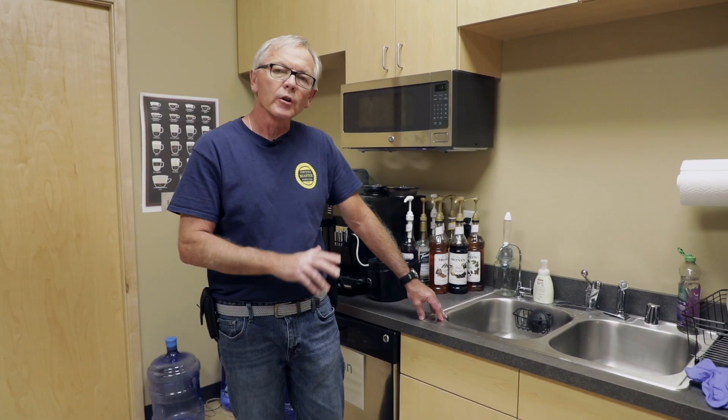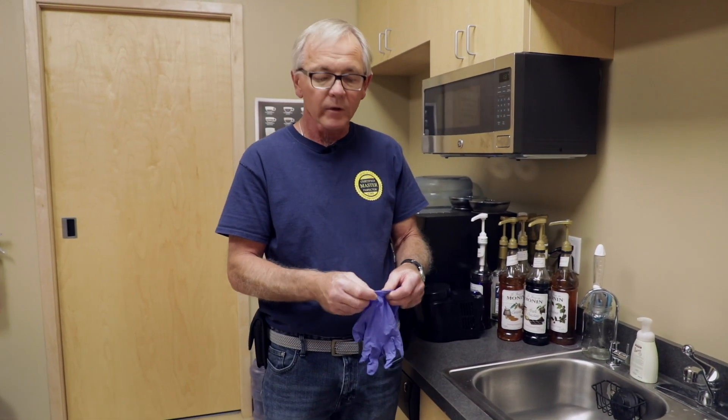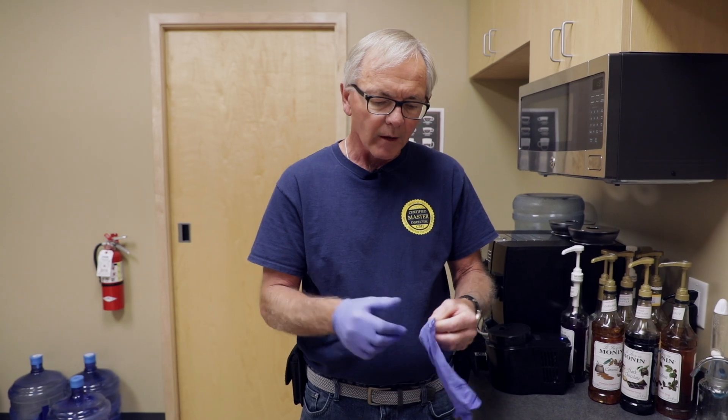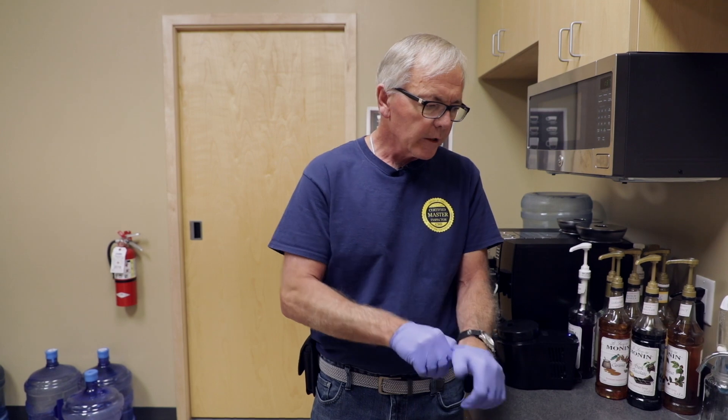The first thing I'm going to do is wear some nitrile gloves. You can also wash your hands very well for this, because what we want to do is protect ourselves from any contamination that we might get on the faucet and could skew the test. So I'll get my gloves on here.